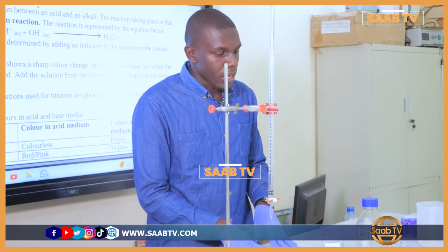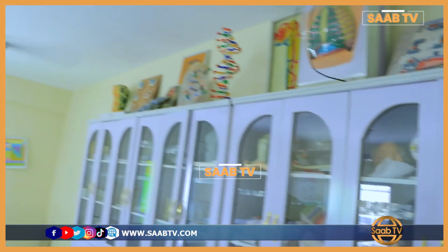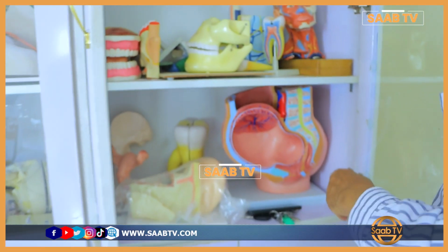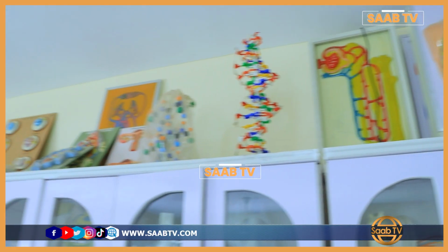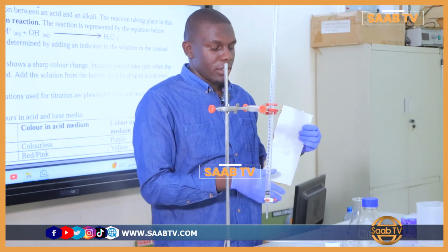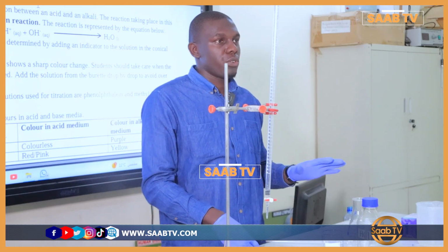Now, during titration, we need a number of equipment or apparatus. One of them, we need this apparatus. How do you call it? Pipette, very good. Then we need the second one, this one here. Conical flask, very good. Then we need this apparatus. It's known as? Burette, very good. Then we also need the ring and clamp stand to support the burette. Now still, we also need a white tile. This will be our white background. We simply use the white tile such that we can see a clear color change during titration.